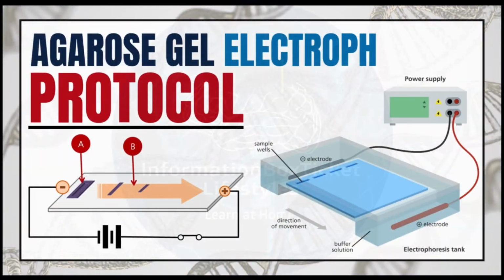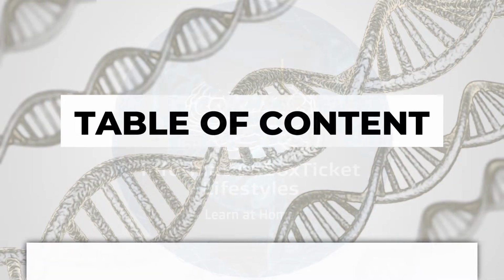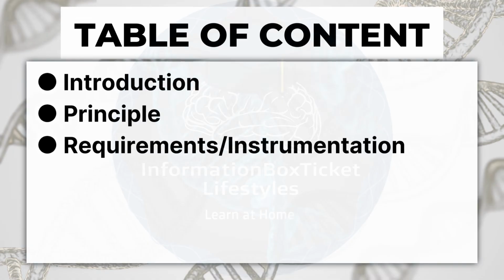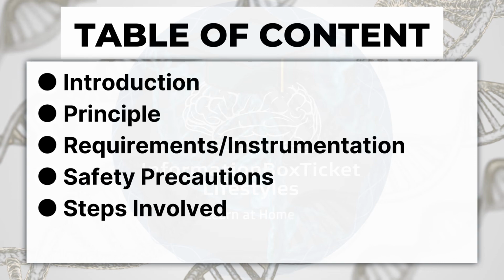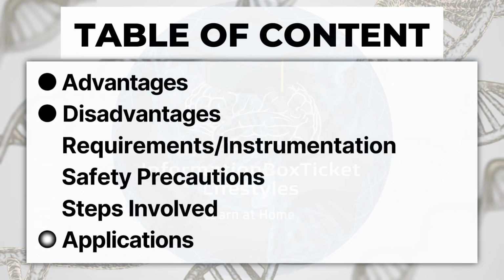Agarose gel electrophoresis protocol explained. Table of contents: Introduction. Principle. Requirements/instrumentation. Safety precautions. Steps involved in agarose gel electrophoresis. Applications. Advantages. Disadvantages.